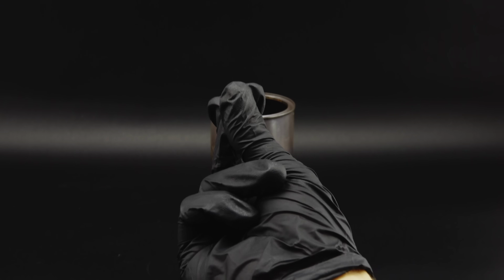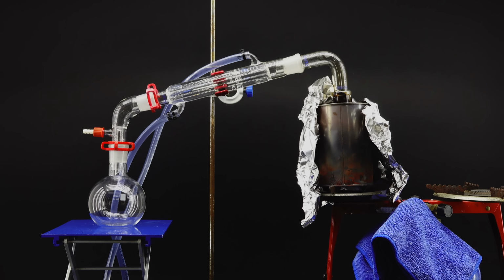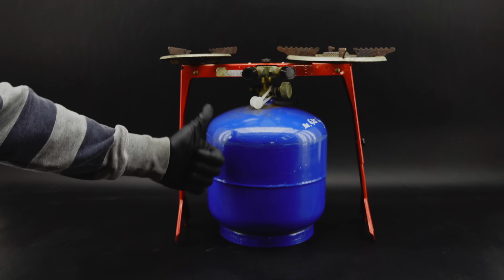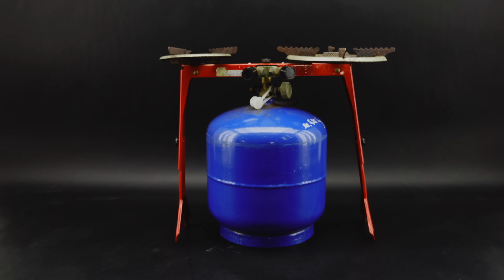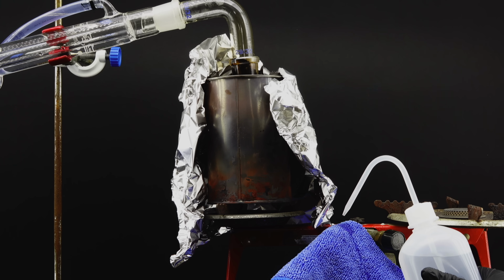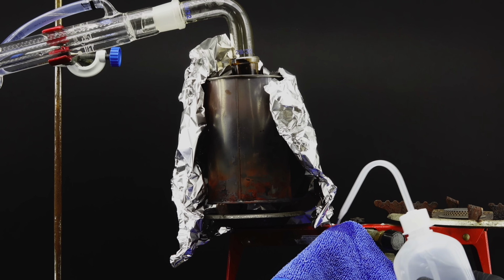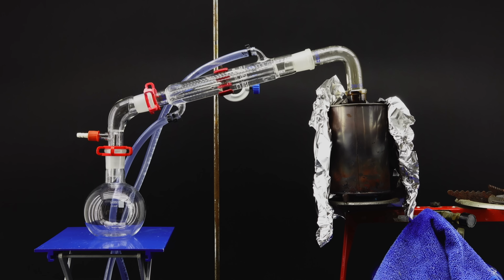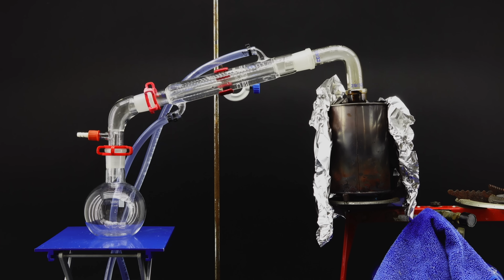When that was done, I assembled one of the cans into a distillation setup on steroids featuring this old gas camping stove. It's stupendously powerful for its size and should be the perfect thing to provide all the heat necessary for the reaction, and I have to cover a part of it with a wet cloth to prevent it from melting itself. Anyway, to begin the reaction, I set the stove to low heat and waited for some vapors to appear. The first thing that should come over is ethylene glycol, which I chose to leave in the can since it will allow everything to fairly mix.